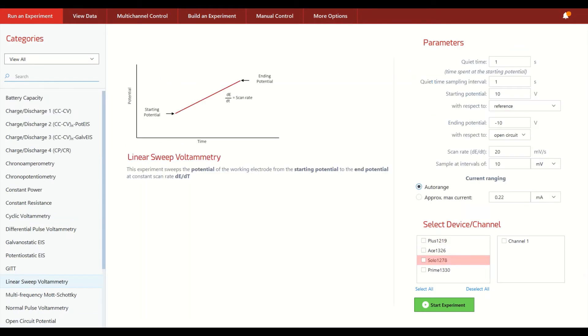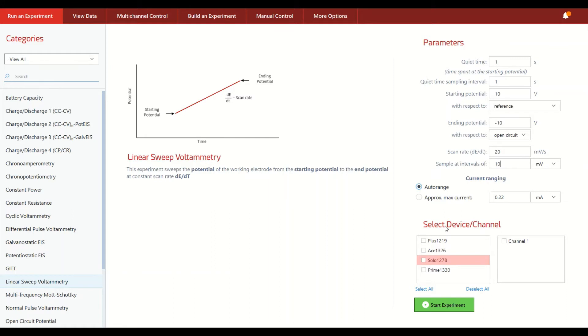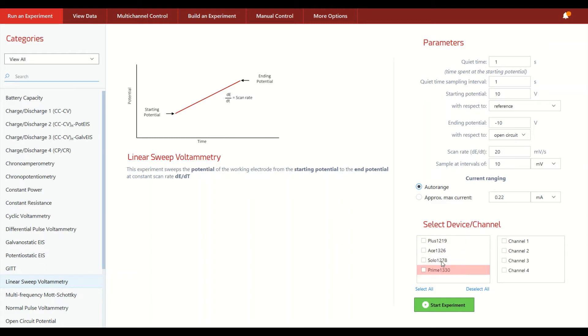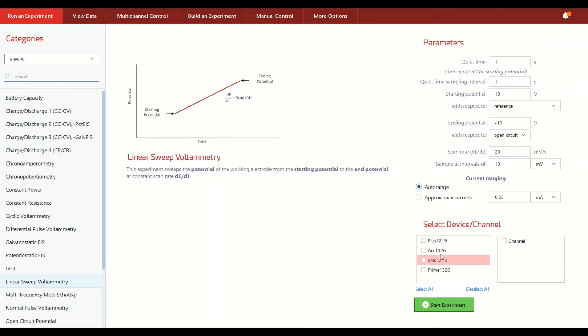After you've decided what type of experiment you want to run and after you have determined which parameters that you want to run based on whatever you are running a measurement on, now it's a matter of picking which Squidstat device or perhaps multiple devices you want to run this particular experiment on. So in this case, we have linear sweep voltammetry with the parameters you see here and all of the different four Squidstats that are plugged into my computer right now are available to run this linear sweep.